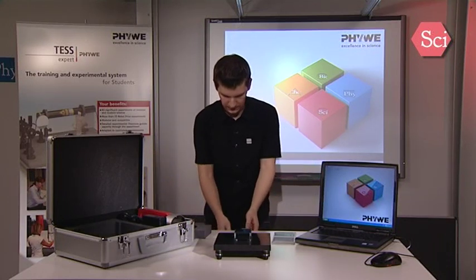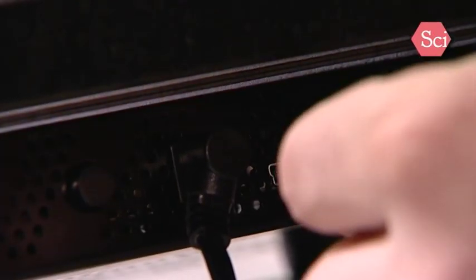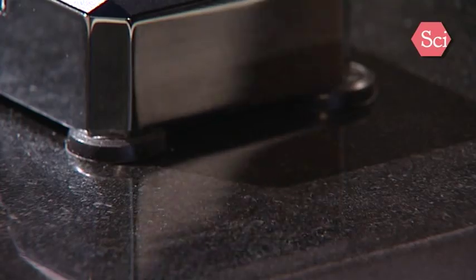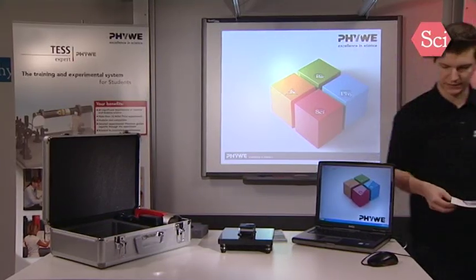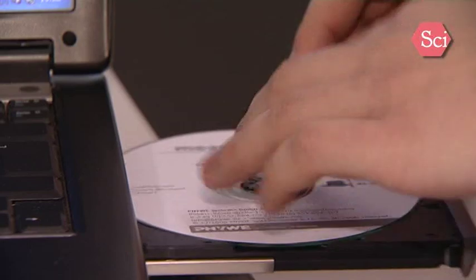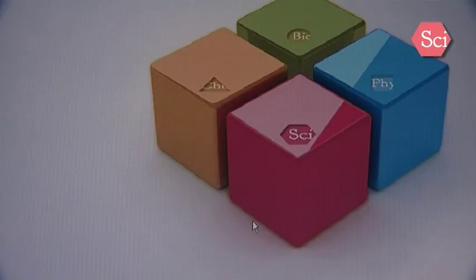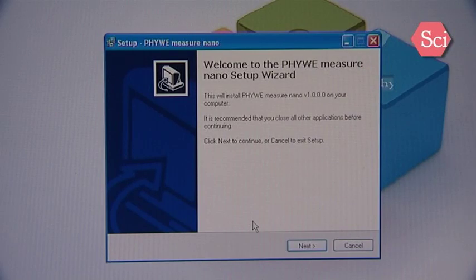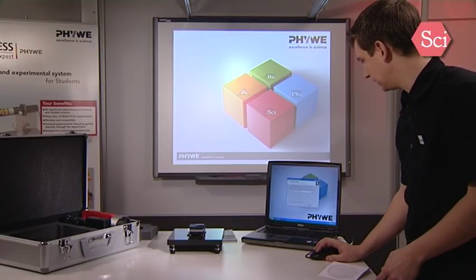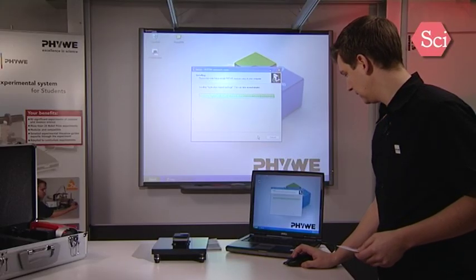Just plug the power cord and the USB cable into your microscope. Take the software CD and install the software on your laptop or PC system. The installation routine should start automatically on your PC. Now the software routine starts up and you use the next buttons to run through the installation routine. Wait until the software finishes the installation process.